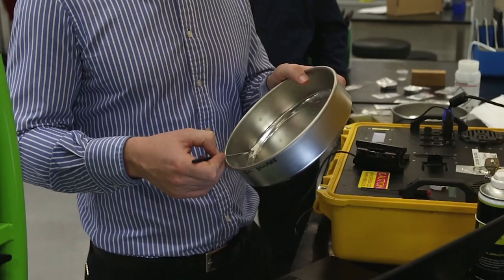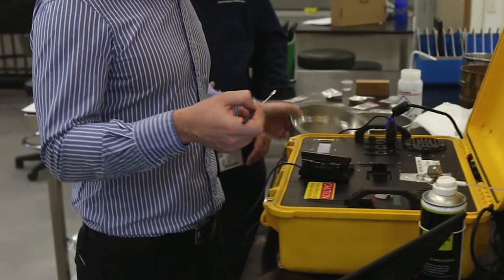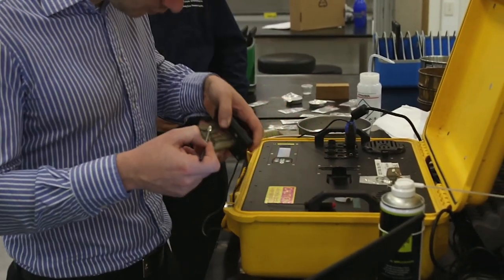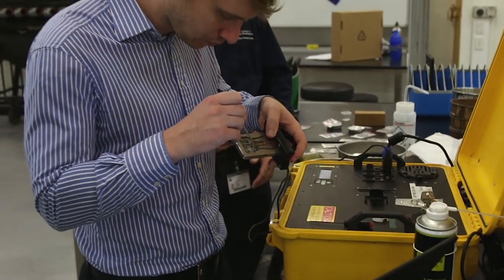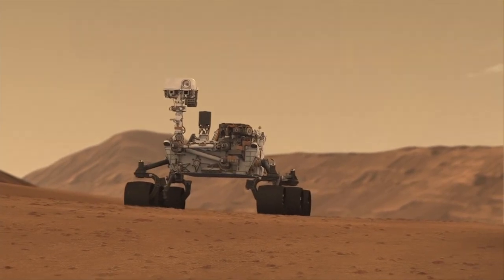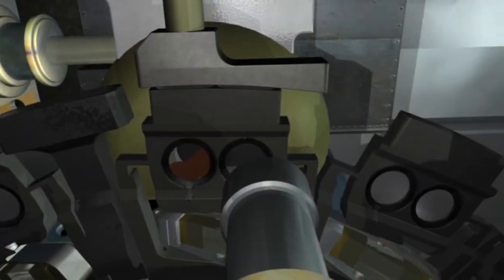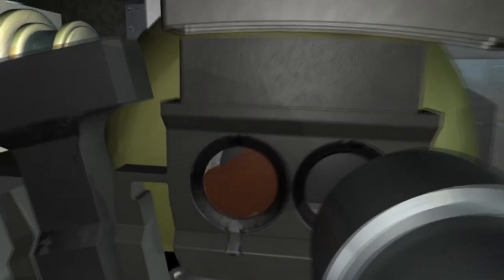So we've got this awesome opportunity that we're using a state-of-the-art x-ray diffraction machine that's been developed by Olympus. It's actually based on the Mars rover, so we're using the same technology that NASA is using for identifying minerals on Mars.